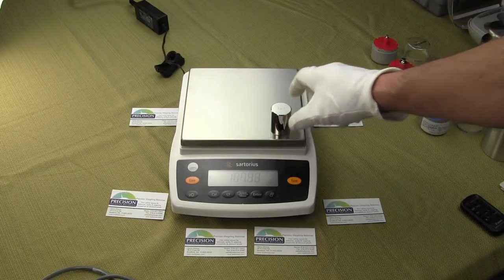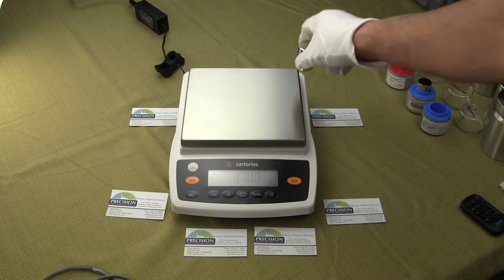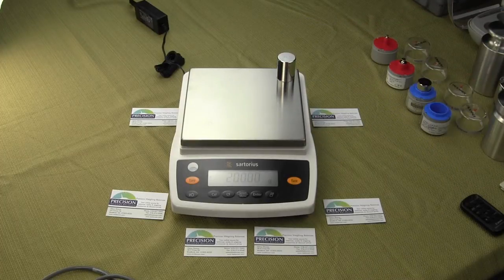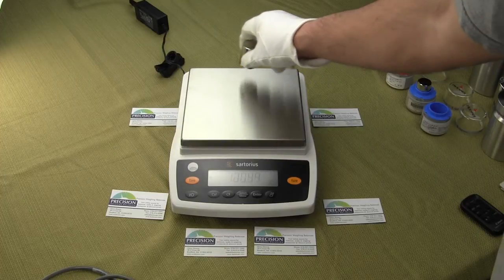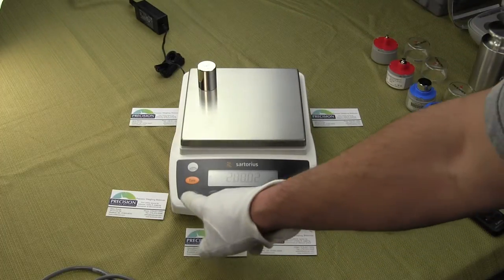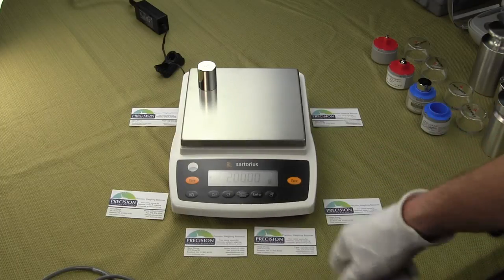The Entrance is basically Sartorius returning to the marketplace since they discontinued the ED and GW series in 2012. The new Entrance Series functions exactly as the ED and GW series in regards to your keys in the front, your tactile keypads. It has the LCD display.